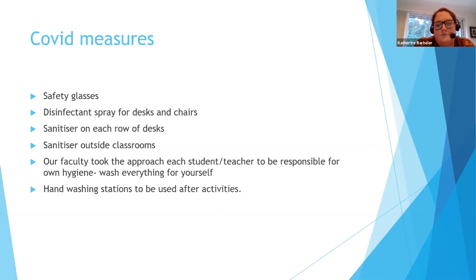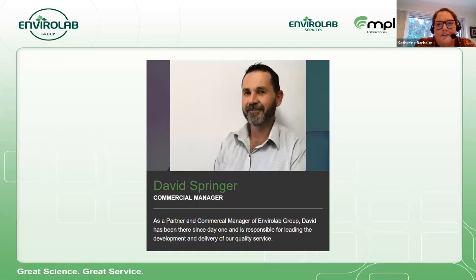As diligent as we are, I think our major risk is we're dealing with very inexperienced and very young students who are a combination of excited, nervous, all the rest of it when they're conducting their experiments. In terms of schools, our greatest risk are the students.